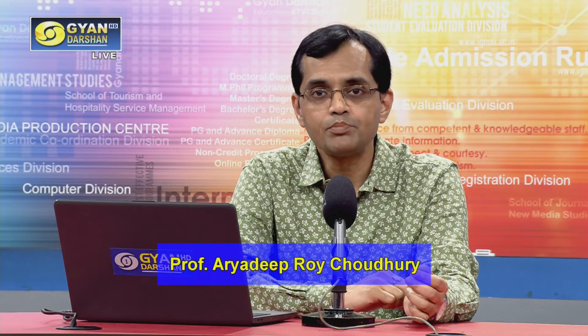Today, we will proceed with further 3 experiments of the same course, that is laboratory course 1. And today we will be discussing the restriction enzyme digestion, ligation and bacterial transformation, preparation of competent cells and bacterial transformation. So these experiments are again part of your molecular biology, the basic discipline of molecular biology. And we will take up one experiment one after the other. So we will start with the restriction enzyme digestion.